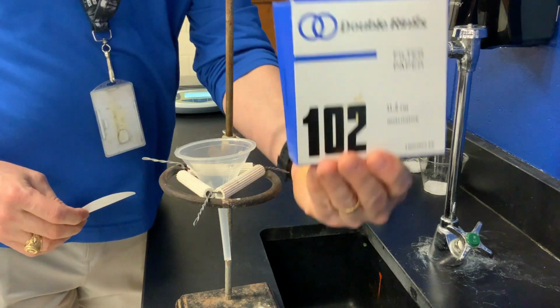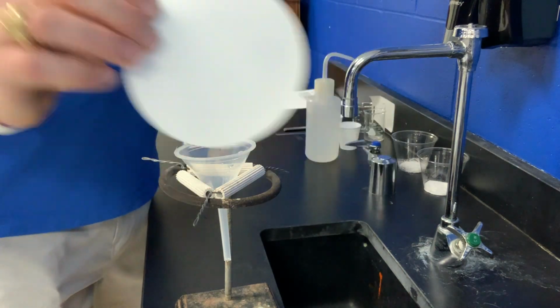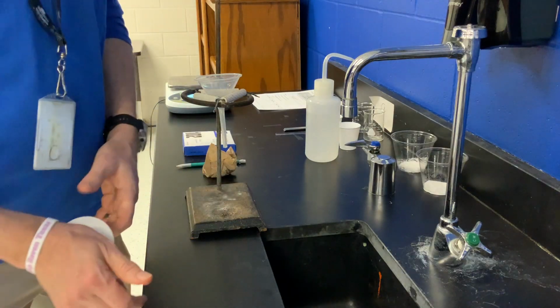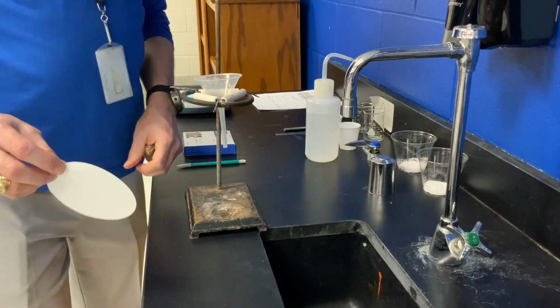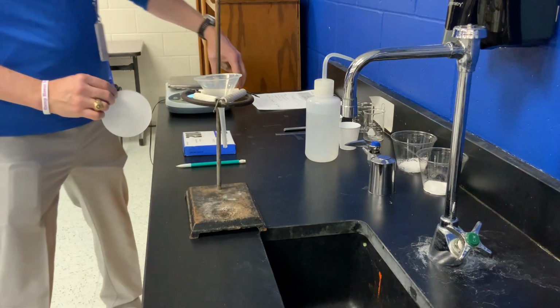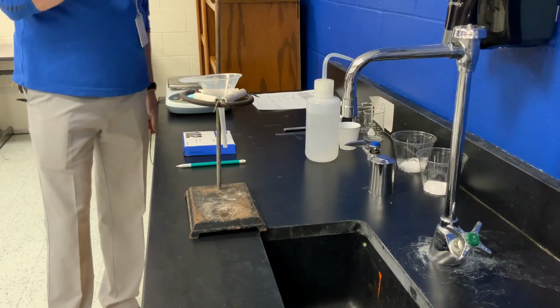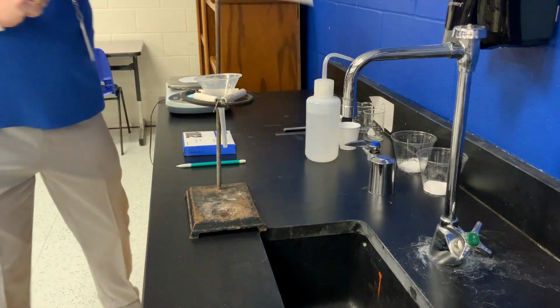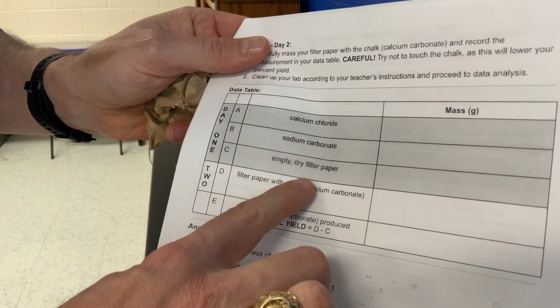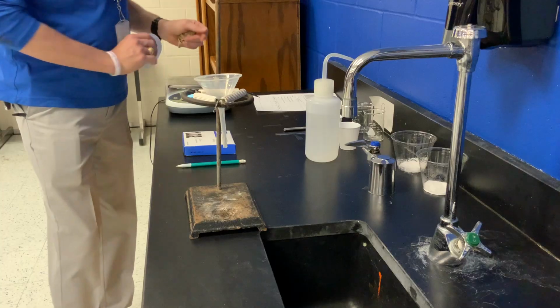So there's the box for the filter papers. That's what a filter paper looks like. I'm going to let you read the instructions for how to make the solutions. They're quite clear. I'm going to focus on the filter paper. Be sure that you zero your balance, weigh your filter paper. You'll see on the data table, it says empty, dry filter paper. If you do not get that data, you will not have a lab.